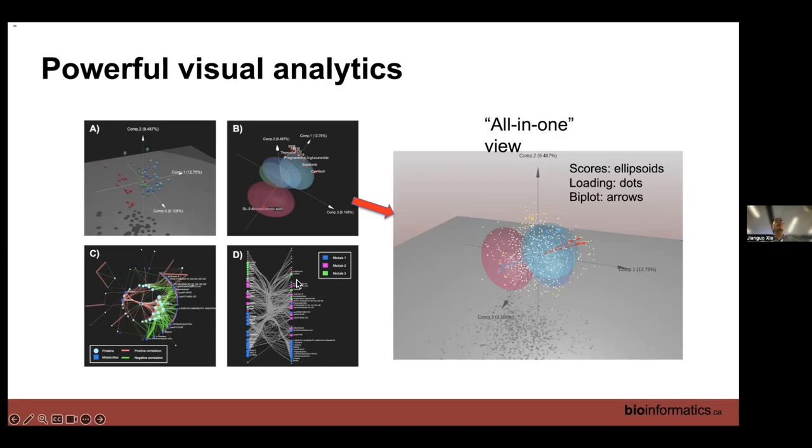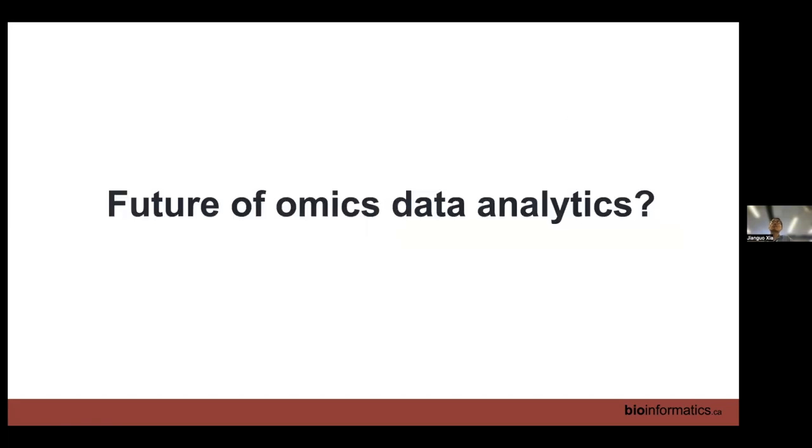The good thing is that if you understand biology, and you're comfortable with this high dimensional dimensionality reduction, you go back and see these correlated features, you find a lot of them are actually talking about the same stories. It's very satisfying when multiple independent algorithms find features that more or less point to the same relationships, and there's much more confidence. That's why we choose to give you the correlations and dimensionality reductions, because multi-omics can still give you false positives. But when you use different approaches and you see they're telling the same stories, you gain more confidence.